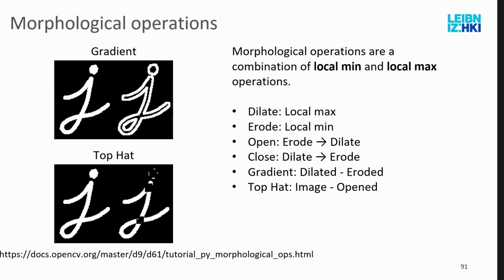It basically suppresses the background around a bright structure, as with the glomeruli. And this is why when you look it up online, this definition of local minimum and local maximum is usually not the one that is given in resources.